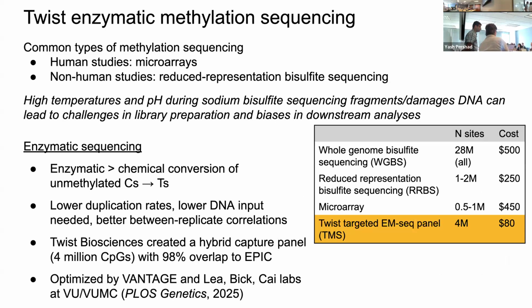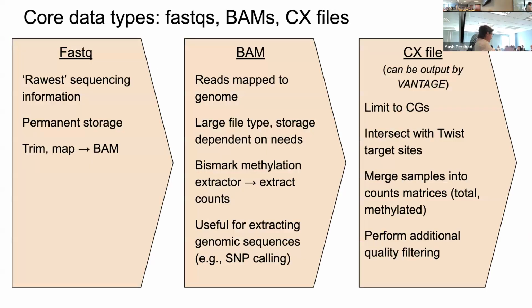Okay, so in the recent history of methylation, there are the common types of DNA methylation sequencing that have been used.